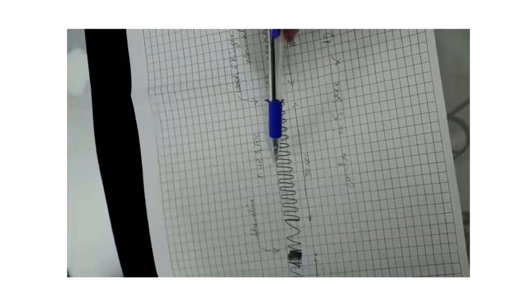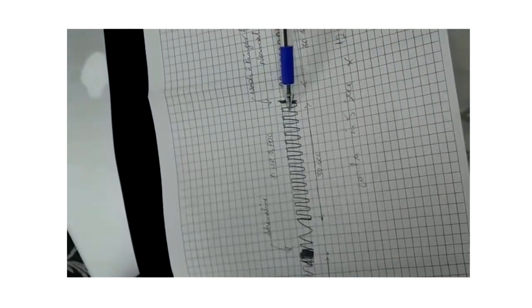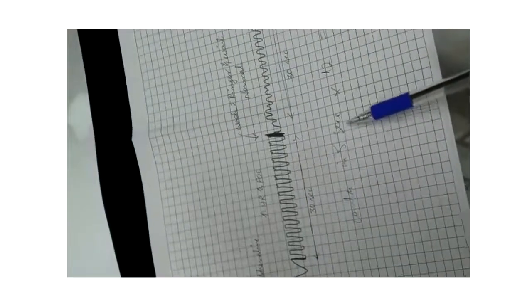Okay, so how will you calculate the heart rate and force of contraction? So the heart rate is calculated by counting each contraction manually or by putting a formula of time tracing. So the formula of time tracing is contractions in 5 seconds multiplied by 12 equals to heart rate.